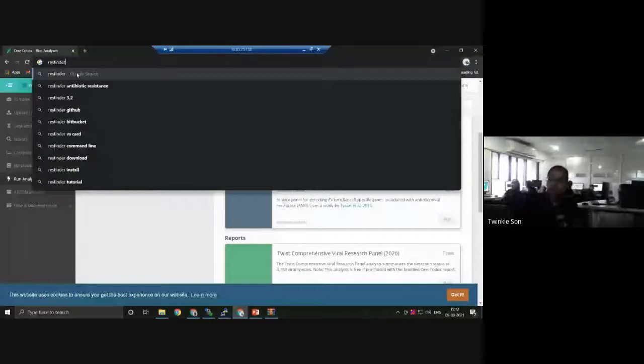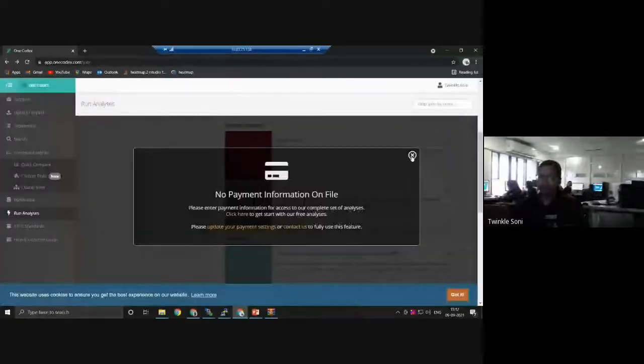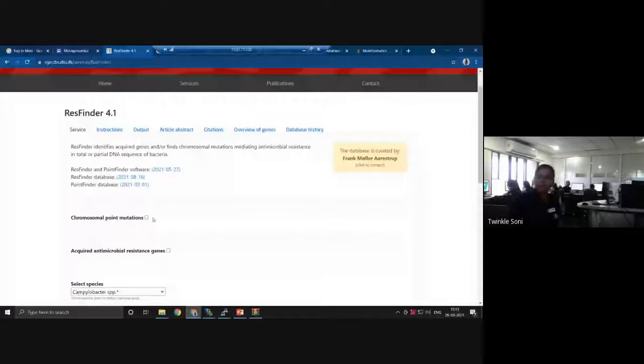Next software is ResFinder. So you can do it for your sample and it is free of cost.